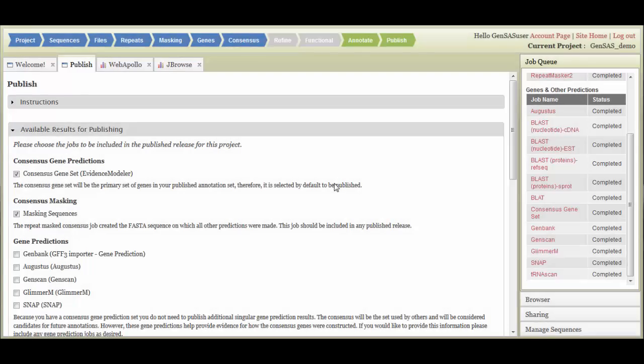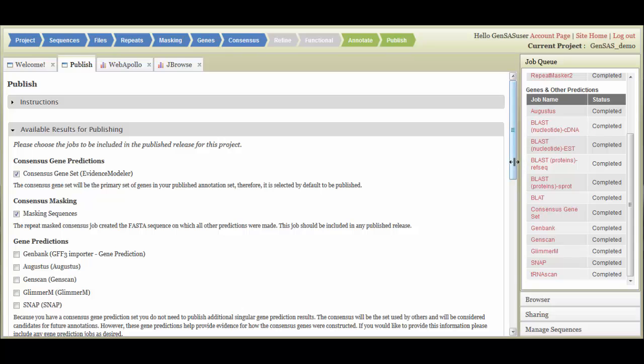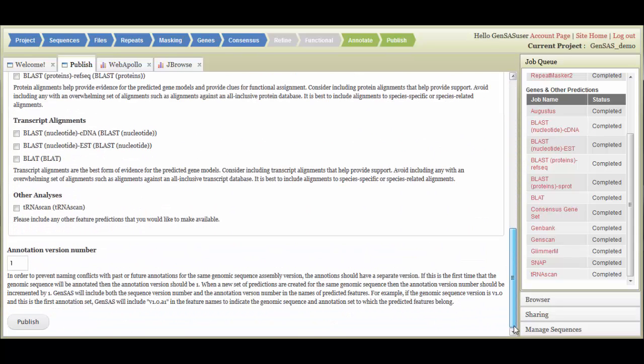On the Publish tab, you can choose which files to export. GenSaaS will export GFF and FASTA formatted files for each of the selected tracks. The minimum amount of information needed for publication is automatically selected, but you can choose to export more data. GenSaaS also incorporates an annotation version number into the exported files. You can set the version number or let GenSaaS use the default of one. Once you have made your selections, click Publish.